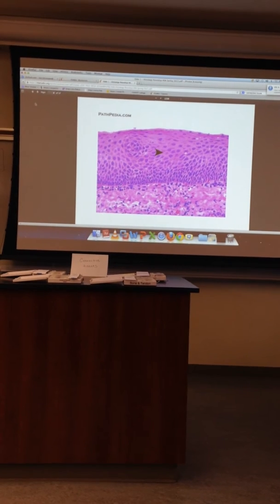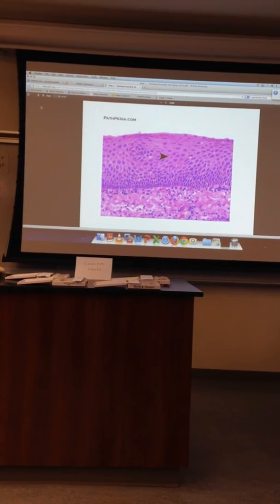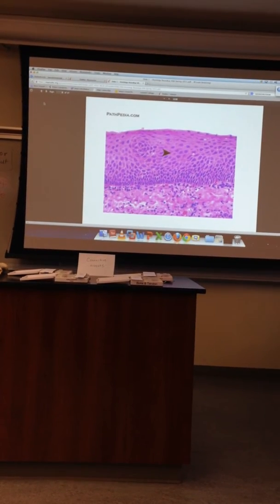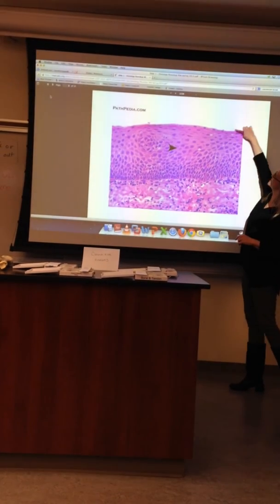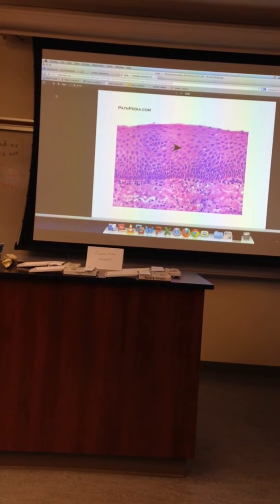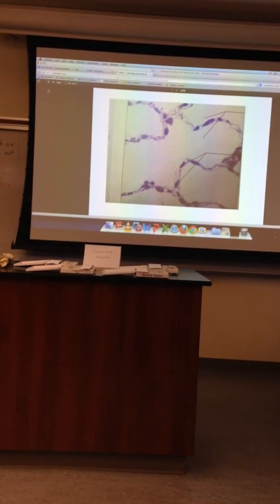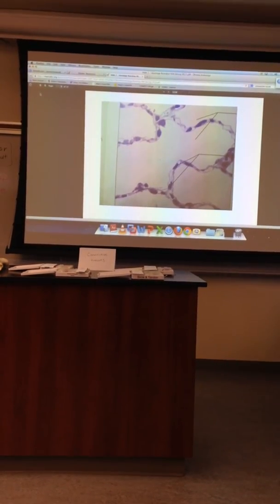You got it? What is it? Pseudostratified. Stratified. What shape are the cells, especially up here? Squamous. Stratified squamous epithelial tissue. Stratified squamous. This tissue we haven't seen in this view. This is the side view, not the top-down view.